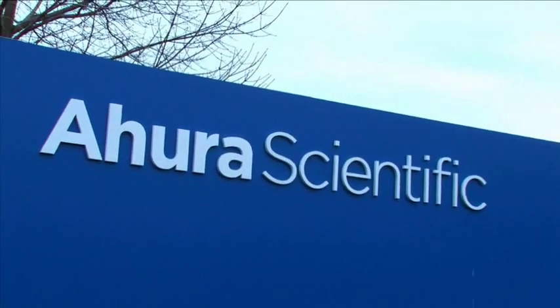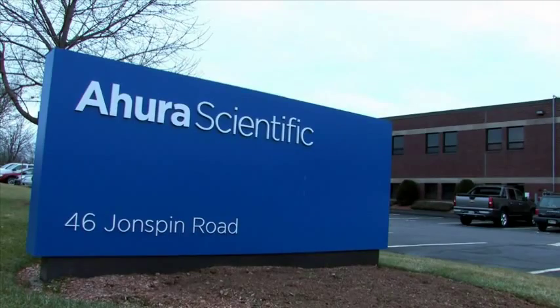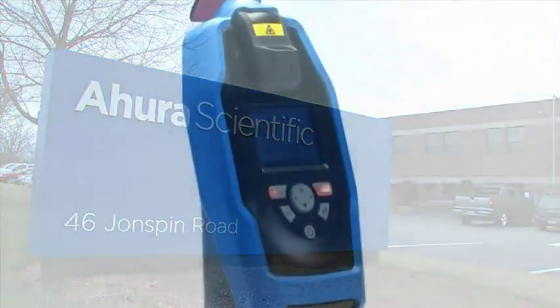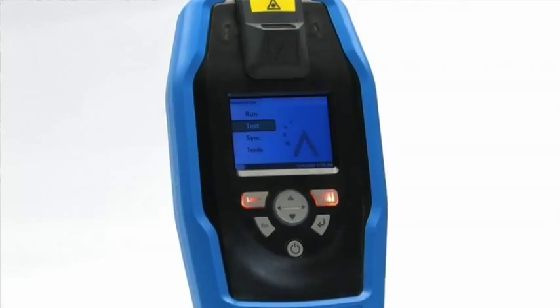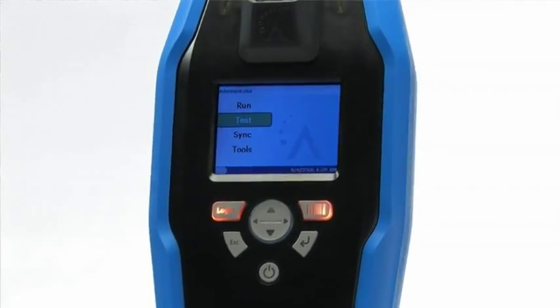Ahura Scientific is the leading provider of a new class of ultra-compact analytical instruments. These rugged, hand-held instruments are used for real-time identification of chemical substances.